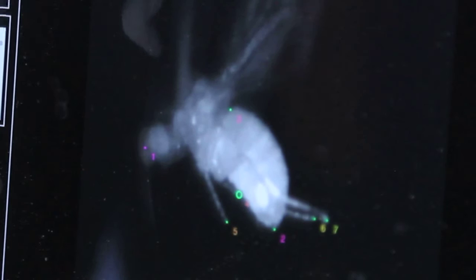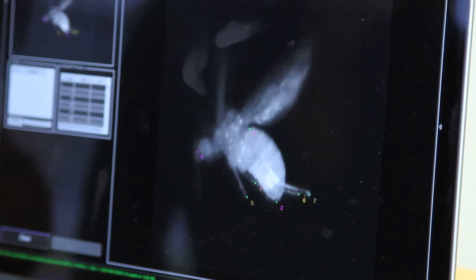This is the left middle leg. This is the right hind leg. So this is point number four — the leg in the background, one of the middle legs. We are manually tracking legs and putting dots on legs for a few training examples, and then she takes that manual data and her algorithm learns where we've placed the dots, and then tries to automatically place similar markers on legs in new videos.